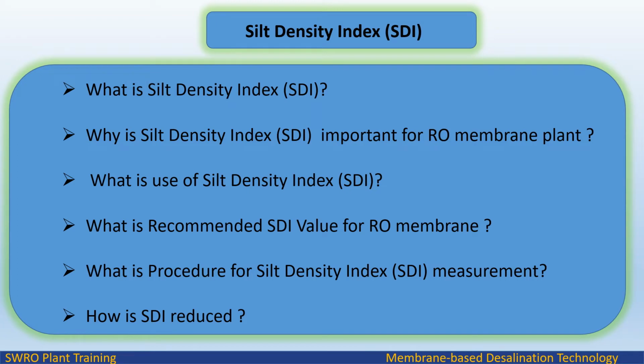What is silt density index? Why is silt density index important for RO membrane plant? What is the use of silt density index? What is the recommended SDI value for RO membrane? What is the procedure for silt density index measurement? How is silt density index reduced?